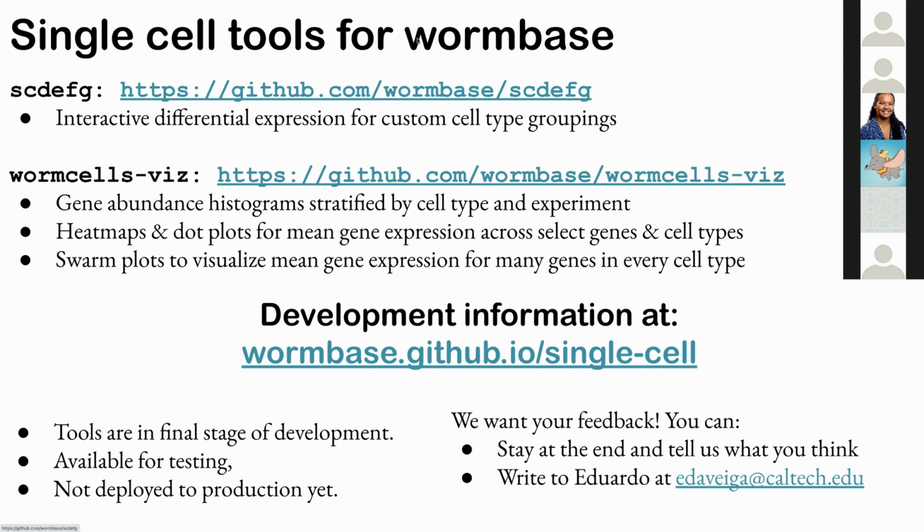The first tool is for performing interactive differential expression, and the second tool is for performing gene abundance visualization, which is to say you can see heat maps, histograms of the distribution of the data, and swarm plots. And I'm going to show you what each one of these are.